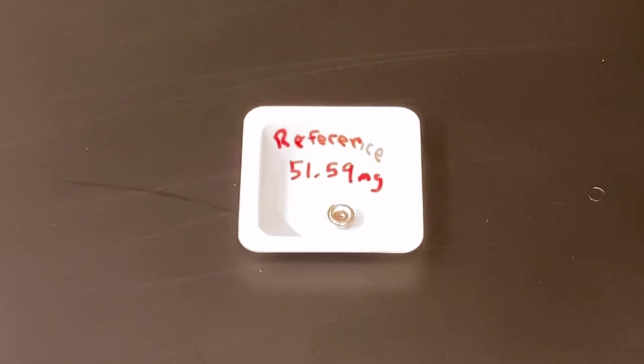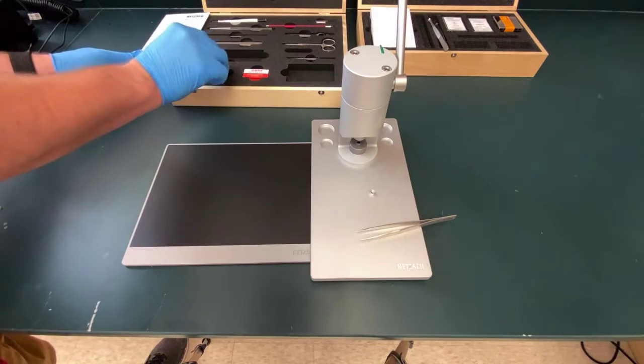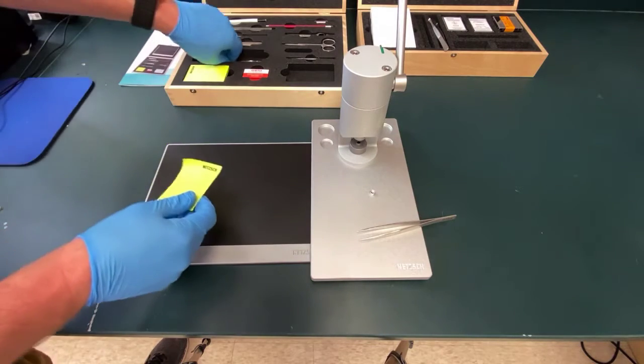Okay, now you need to weigh your reference pan that you just made. I suggest using the Sartorius balances that are in room 329, our normal lab room, alongside the windows there. These are the ones that are accurate down to 0.01 milligrams, and that extra accuracy is really important for what we're doing here with measuring such a tiny sample. Something very important is you want to make sure you don't get this mixed up with your sample, otherwise you'll have weird data.